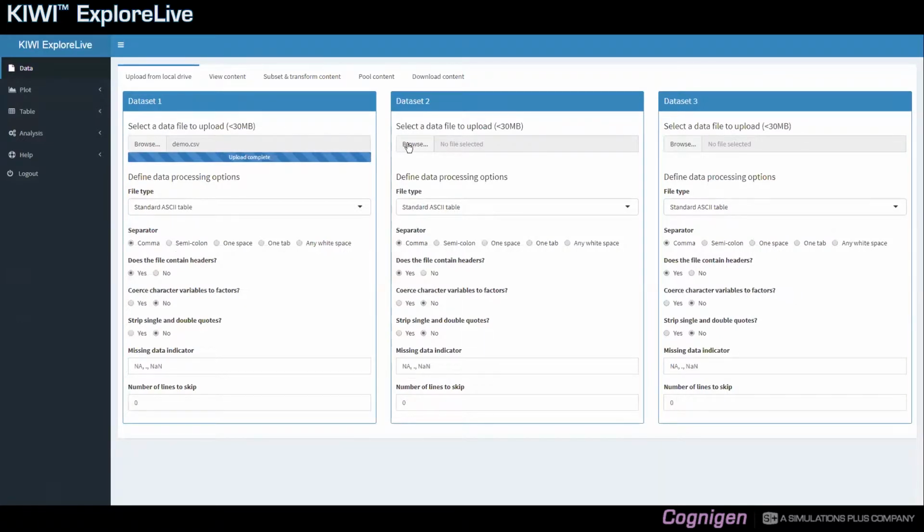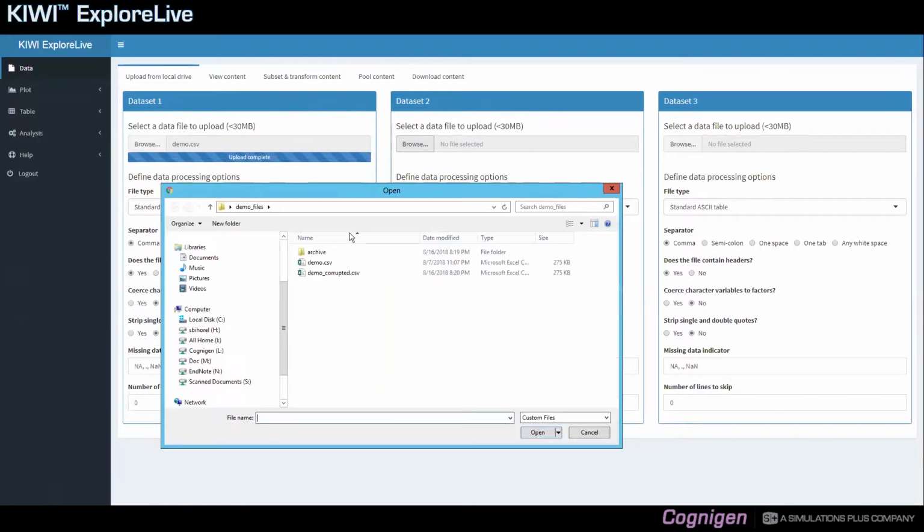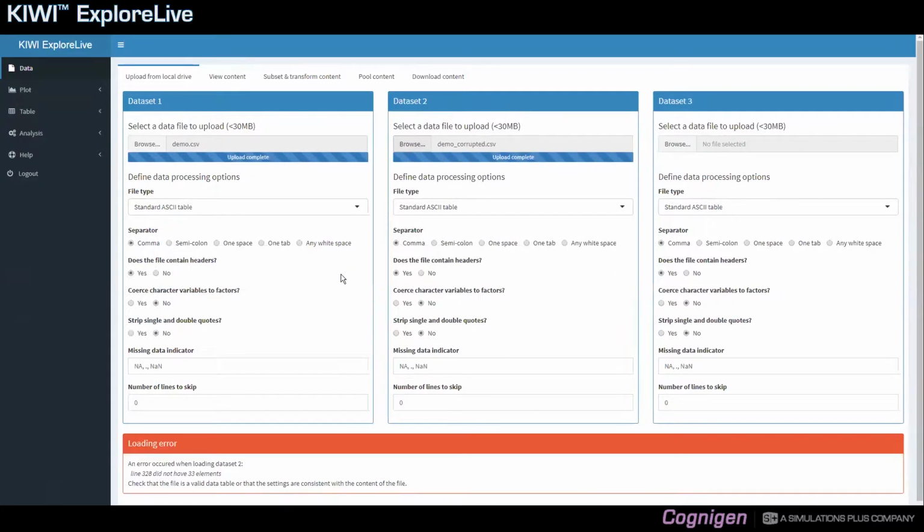If you try to upload a data set that is somehow corrupted or that does not match the requirements of dimension that I mentioned at the beginning of this video, you will get some form of error message at the bottom. Sometimes KIWI can identify what was wrong with your data.